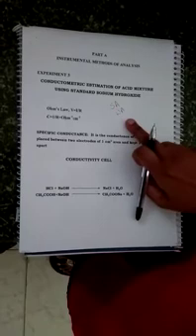Activities: conductometric estimation of acid mixture using standard sodium hydroxide. The analyte sample given today is an acid mixture having a strong acid and a weak acid. Strong acid means one which ionizes completely, weak acid means one which ionizes partially. Examples of strong acids are hydrochloric acid, sulfuric acid, nitric acid. For weak acid, it is acetic acid or formic acid.